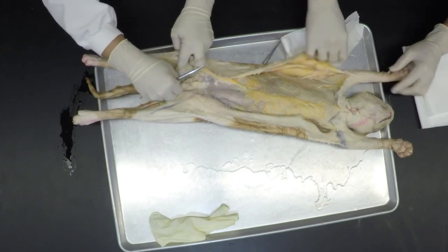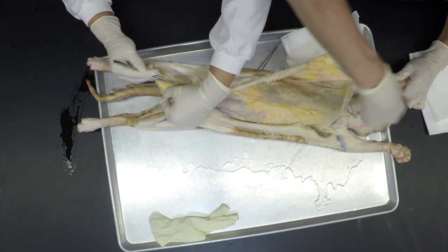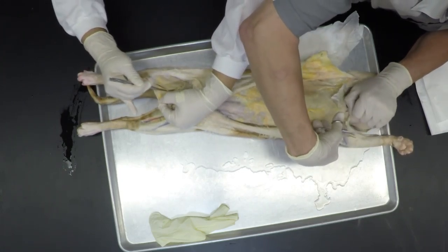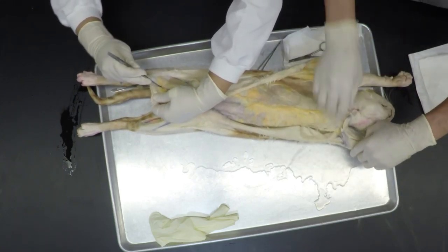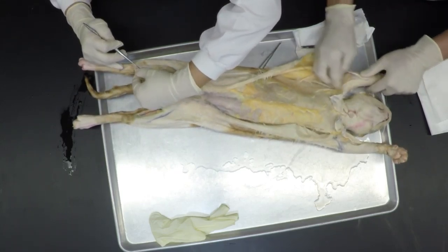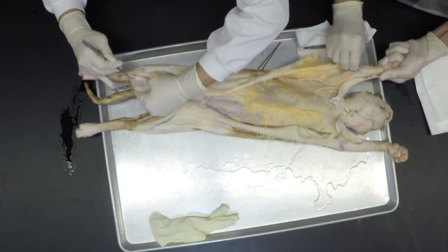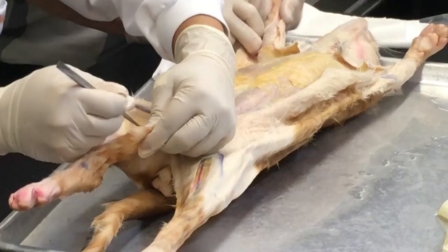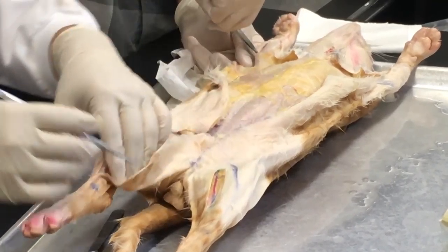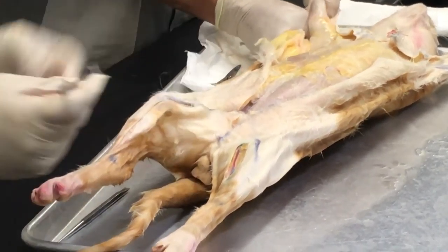Using your finger. Okay, when you reach this area, you see the vein here. We want to preserve this vein, so very carefully separate it from the skin. In any place that you pass along the body where you see big veins or arteries, make sure not to cut them. With the back of your probe, which works like your finger, you can separate the skin. She cuts around the wrist.